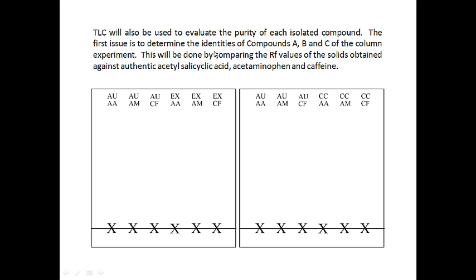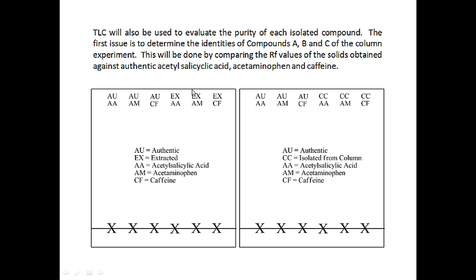So you're going to do this for the extracted acetylsalicylic acid, extracted acetaminophen, and extracted caffeine.